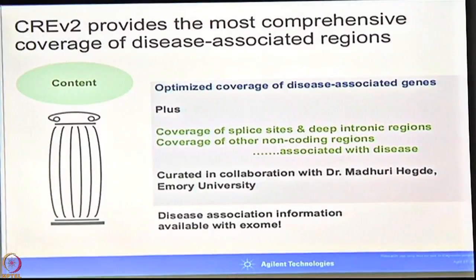So, the content for the probes basically is designed by Dr. Madhuri Hegde from Emory University, and they make the probes which cover all the disease-associated regions, exonic and intronic parts, covering the maximum rare disease parts.